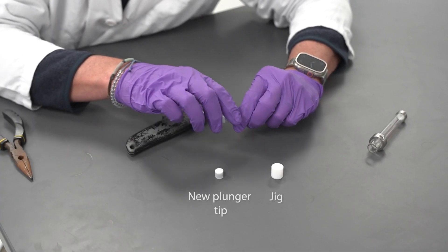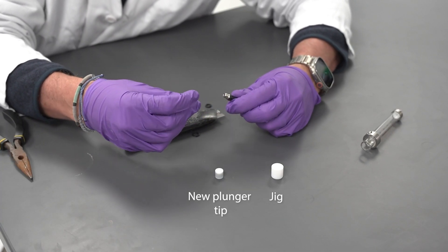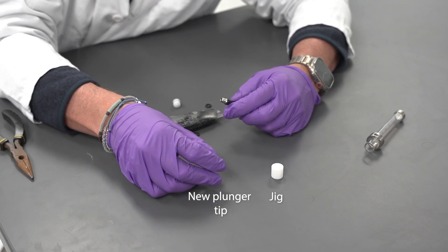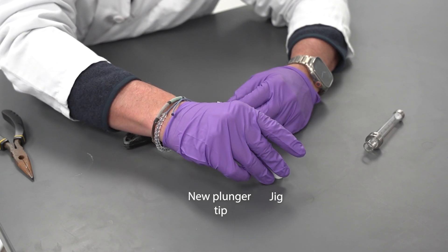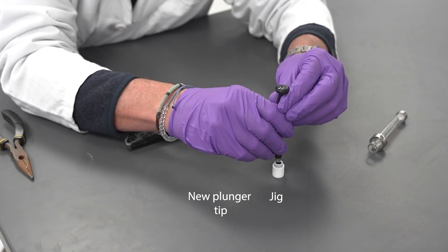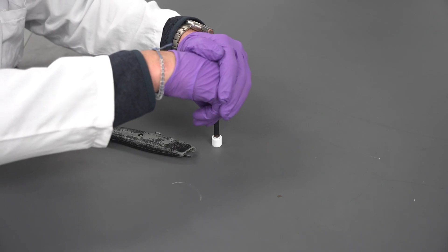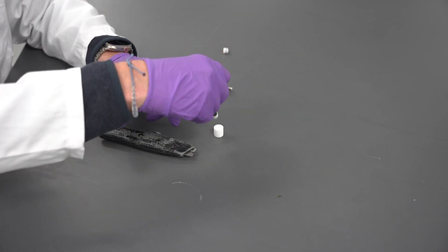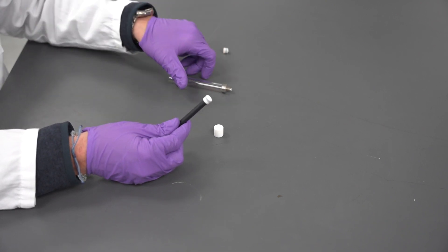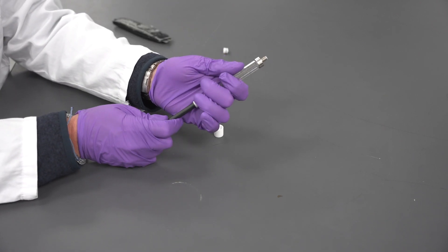Place the new plunger tip on the end of the plunger and use the jig to seat the plunger tip onto the plunger. It's very important to use this jig to seat the new plunger tip to retain the shape of the tip. Using a flat surface to seat the plunger tip will result in a deformed plunger tip.